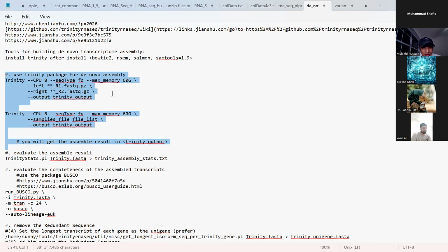The RAM I was using was 1.5 TB, and I was using around 32 CPUs. Using all these resources, it took around 2.5 days. So if you are using your own computer with limited resources, you can accept it is going to take a while.